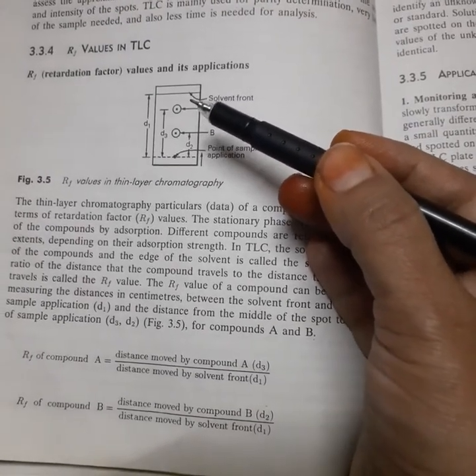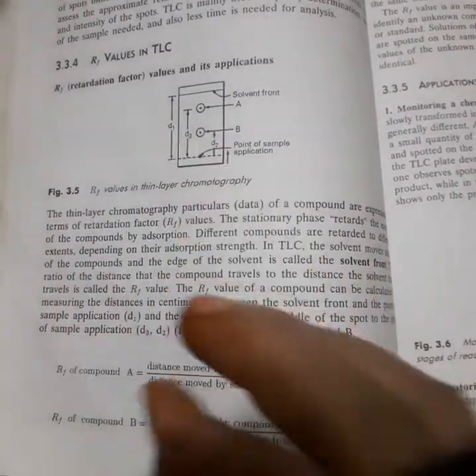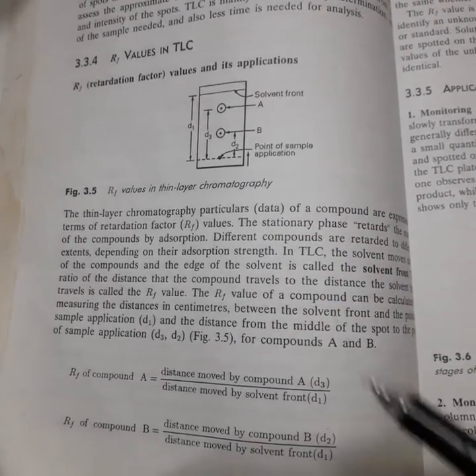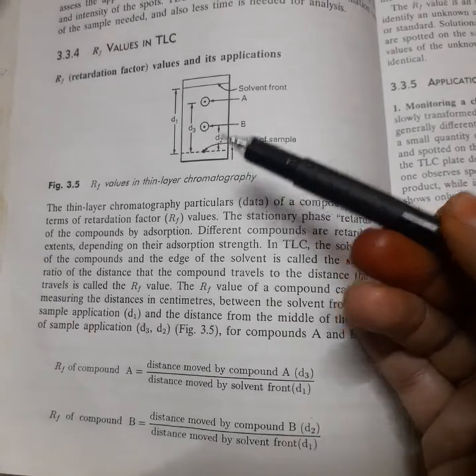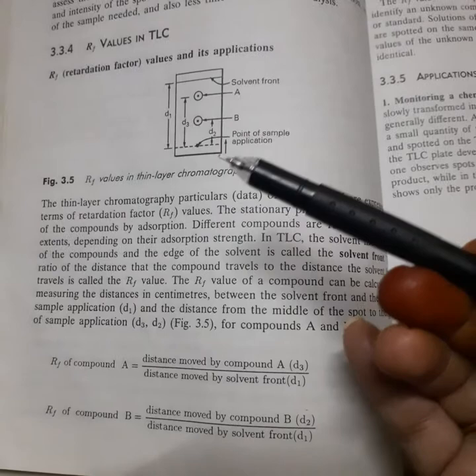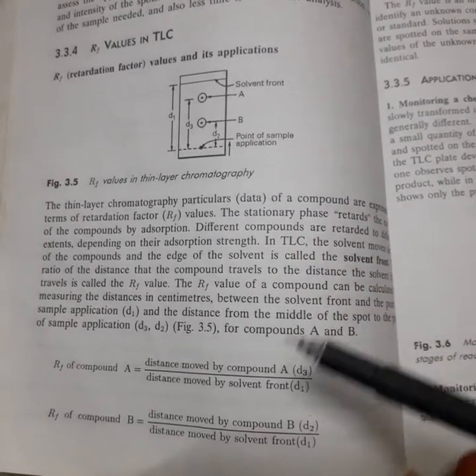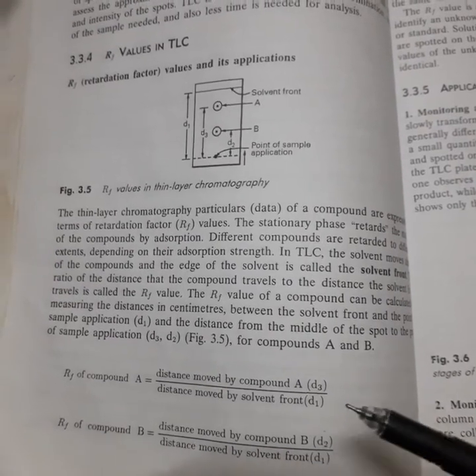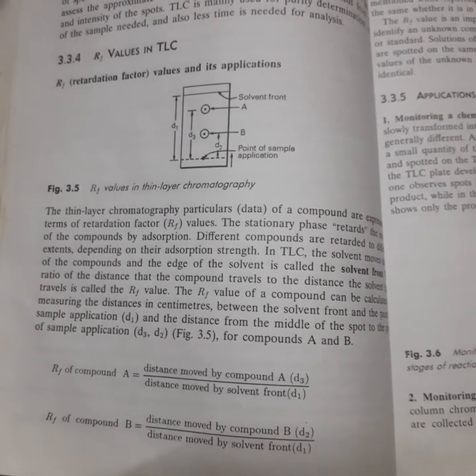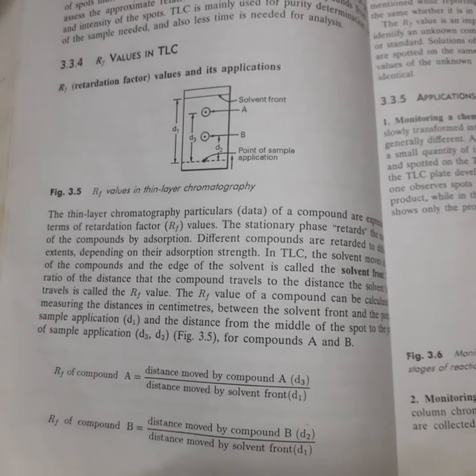Some students may pour silica gel G evenly and somebody may pour it with a greater thickness. So depending upon the thickness of the slurry, as well as the silica gel or alumina we are using for preparing the slurry, and the solvent phase we are using, the RF values will change.